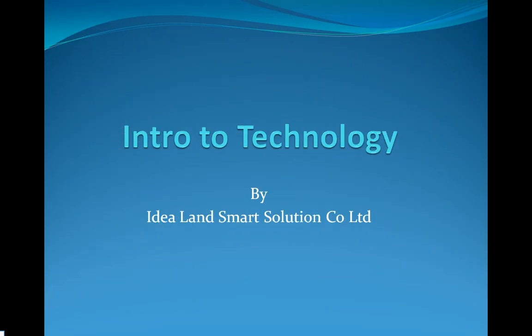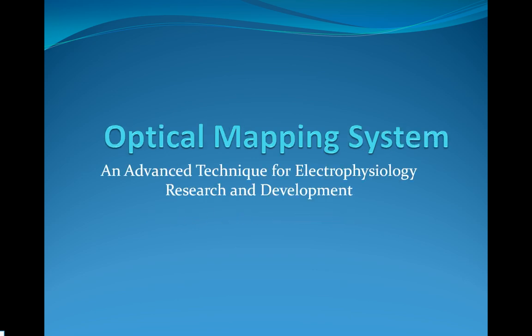In the name of God. This video is an introduction to optical mapping technology. Optical mapping system is an advanced technique for electrophysiology research and development in the pharmacology field and some basic science.